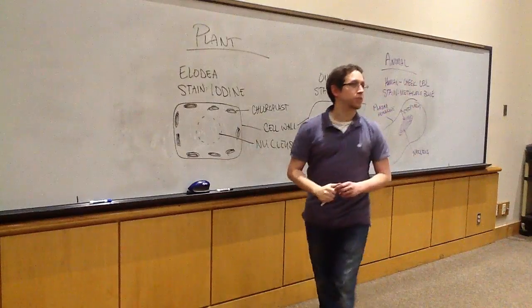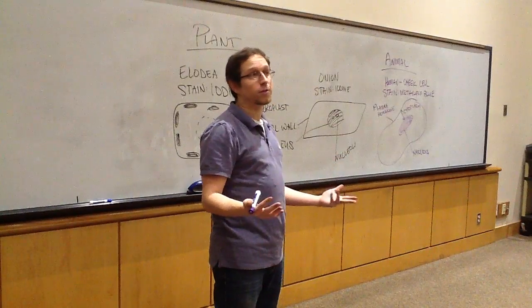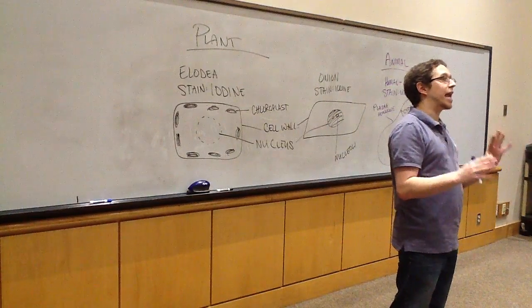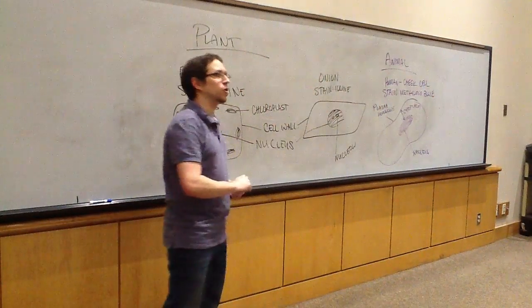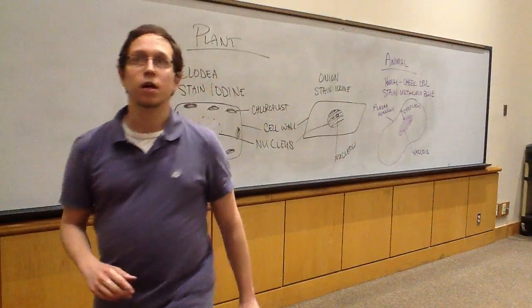That's really all I have to say on microscopy. Now, outside of that, I would say knowing the different parts of the microscope and their relative function is always a good idea. And I've got pictures with descriptions, I believe, on the website. Also, knowing how to view things under the microscope can't hurt you. And I think I also go through the chart about the depth of focus and all of that. Okay? So watch those review videos.